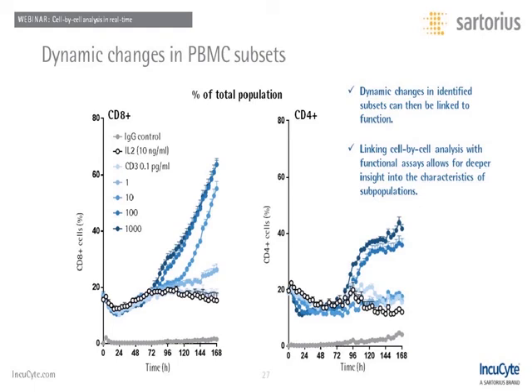The graph in the middle shows CD4 cells do respond to the CD3 stimulation, and there is a similar temporal pattern. However, the result is much less, with only 40% enrichment. We can extrapolate this data to suggest that the increase in total cell proliferation, as seen in the previous slide, is mainly due to the CD8 cells.